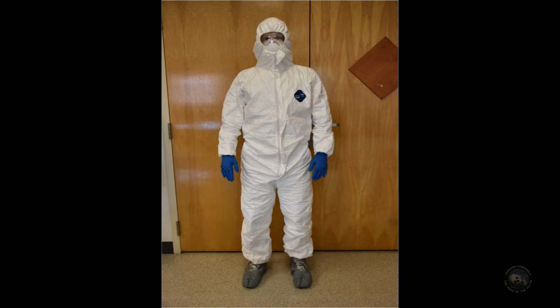I know what you're thinking, but we're looking for latent fingerprints. Latent fingerprints contain DNA from your suspects. So if you're cross-contaminating enough, your DNA can actually overwrite your suspect's DNA. This is what you should look like. If you are not doing this, you are faking it. So fix yourselves.